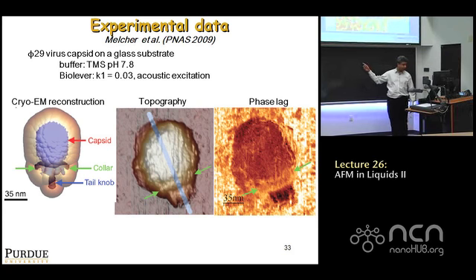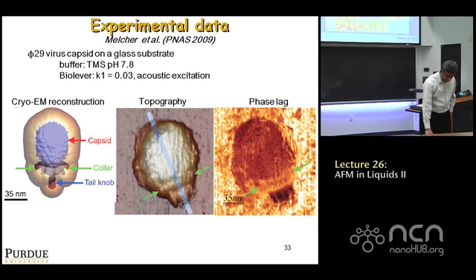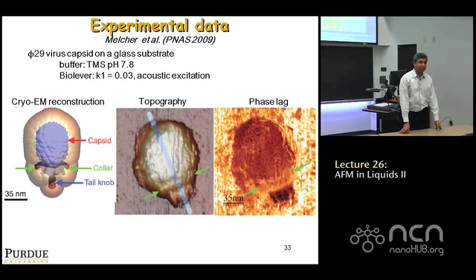It was a comparison of the image we get with an AFM with that taken from cryo EM, which you can get from databases online. Oh, it's not that you have a chamber in your AFM. No. So all liquid AFM we're talking about is physiological conditions, ambient temperature.